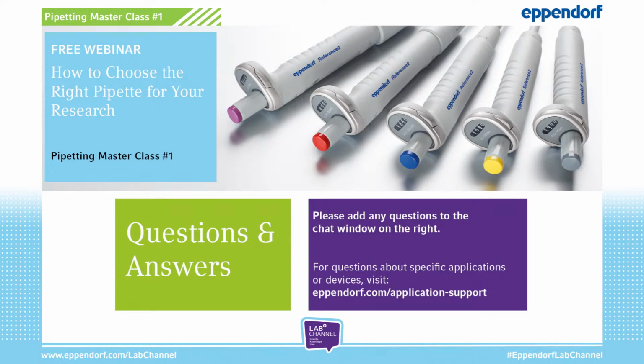So actually, for highly viscous liquids, your first choice should be the positive displacement system as described in the webinar. However, when you do not have a positive displacement pipette or dispenser, you can use a reverse pipetting technique. You will probably increase your accuracy. However, it will not be as good as with the positive displacement device. But of course, reverse pipetting is better than cutting the tip. All right.